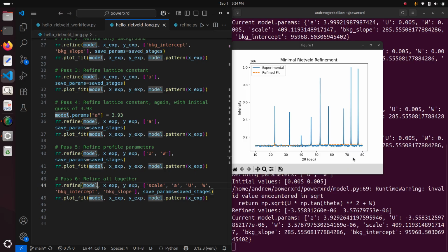Perhaps it's found, I'm not so sure what's happening here. Maybe it happens in common Rietveld analysis. But maybe what's happening is that, because the results were already really good, it's doing some exploration on its own, and maybe it's diverting too much from what should be the most accurate match. If you do understand what's happening here, I would really appreciate it in the comments.